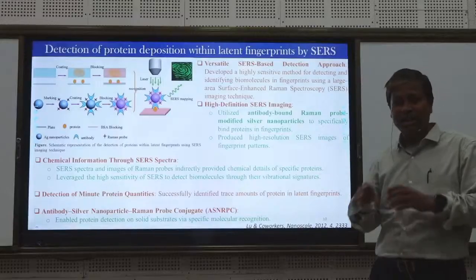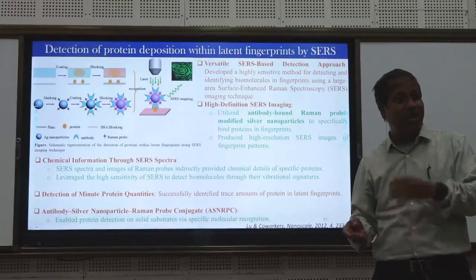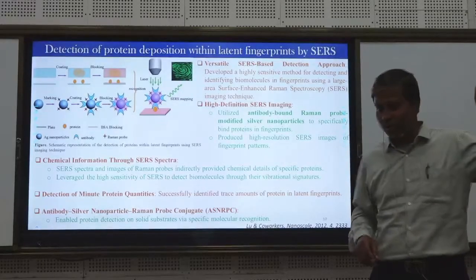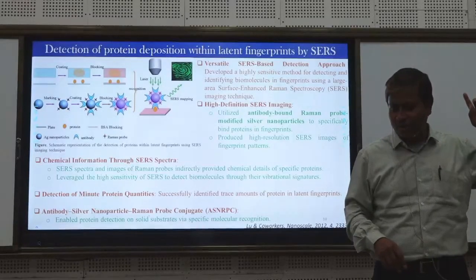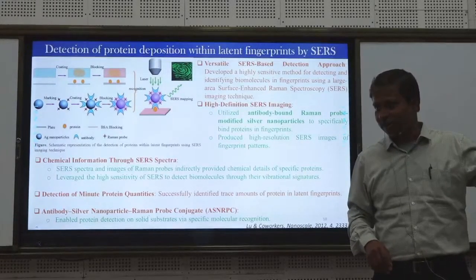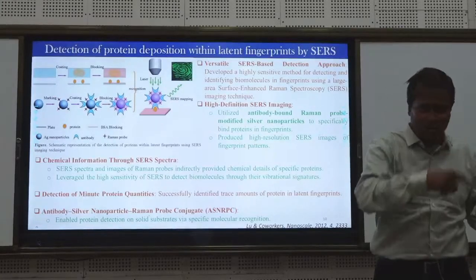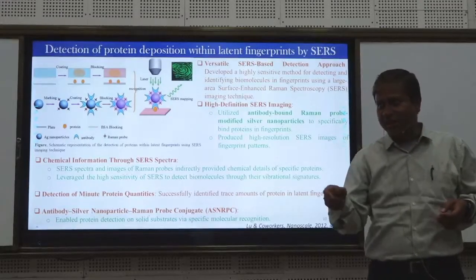Many spectra today also will appear like there is no change. Yesterday I noticed that when Professor Hiramatsu was recording the glucose solution, he felt like it was water. He initially thought it was water because of the strong water band, the OH stretch and then the bending.